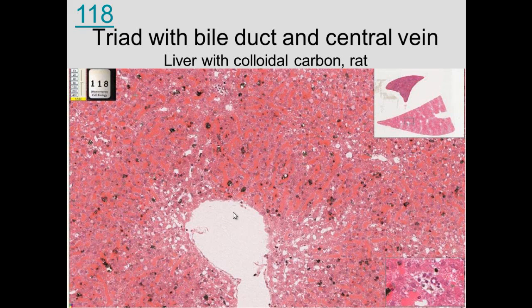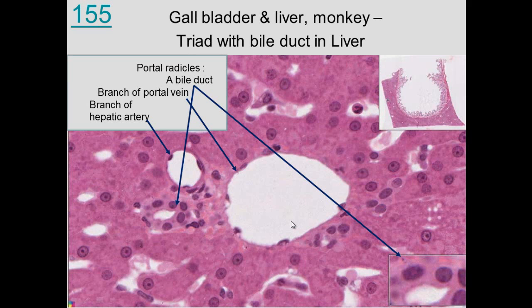Here we see the liver. There's a central vein. You can see the kind of pink here are the hepatocytes. The solid kind of reddish color are the red blood cells that are in the sinusoids. And here we can see many Kupffer cells throughout that have a role of cleaning the blood in the liver.